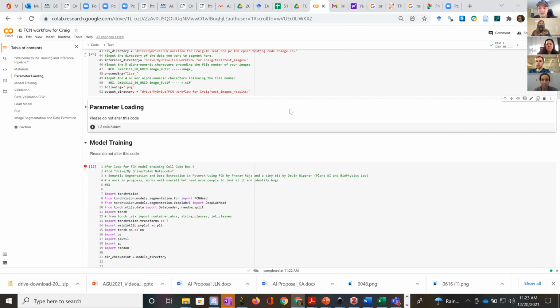It would be really interesting to try to make the grandmother or granddaddy of all models, right? And feed in all the annotated images that Andrew and Craig and Mason and everyone else has. Mina, I know Mina's annotated a ton. I'm sure you all have too. So yeah, that could be something. And then we have a model that just segments everything. But we haven't done that yet. Okay, good. Thank you.